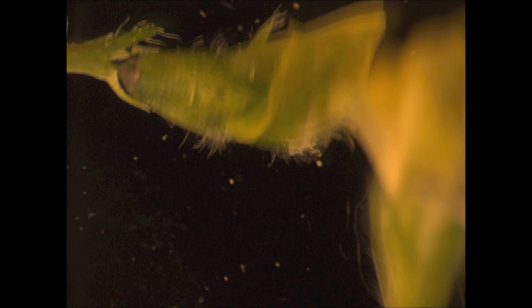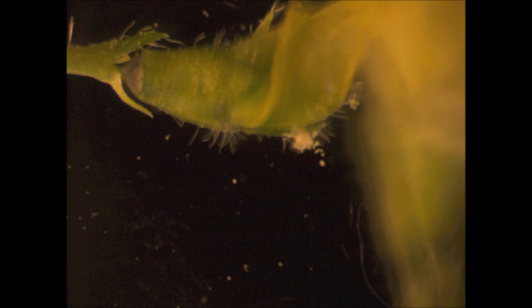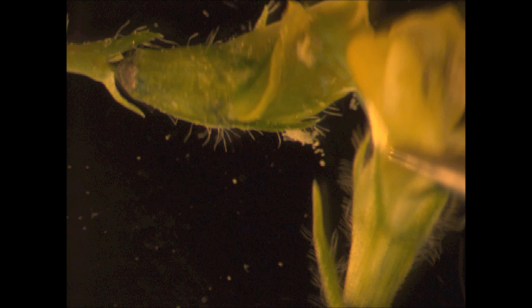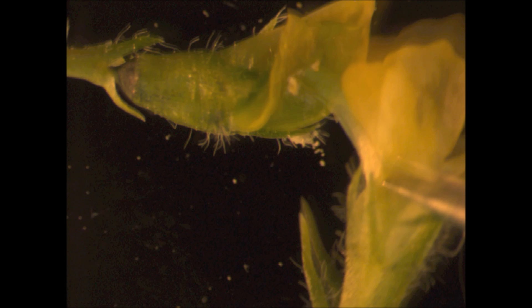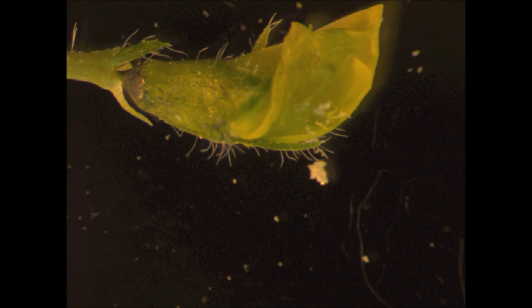To deposit the pollen grains on the stigma surface of the emasculated female flower bud, place the tip of the sexual column — carrying already ruptured mature anthers with pollen grains — onto the stigma surface, and then gently scrub multiple times by wiggling. After this, you can see a tuft of pollen grains deposited on the surface of the stigma tip of the female flower.